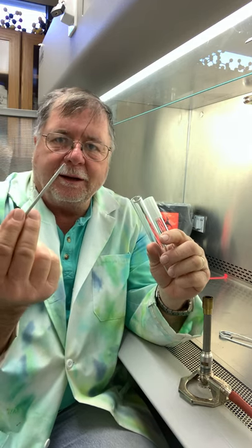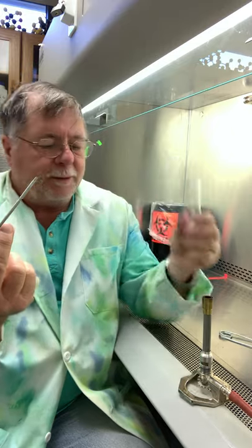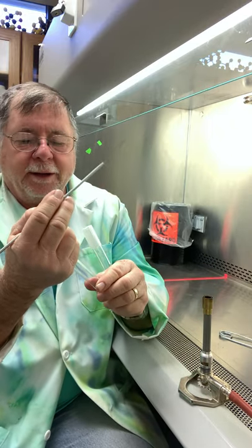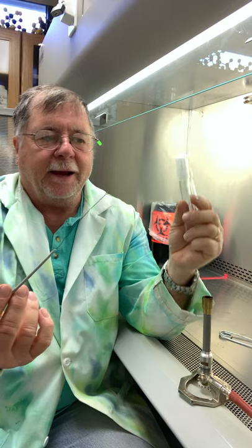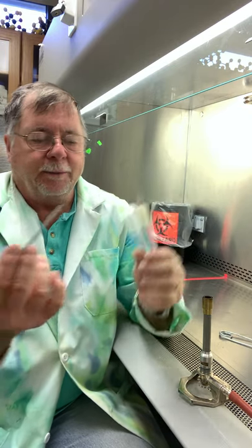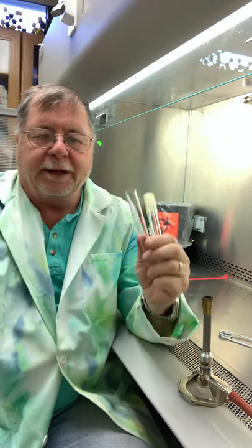And then this has bacteria on it, okay? Well, we're not done with this tube. We have to flame it one more time. Flame it, roll it in the flame, put our cap back on, and then we can roll this tube to the other side. Now this is the new tube that doesn't have any bacteria in it. Okay, we have to flame it, and then we can add our bacteria.